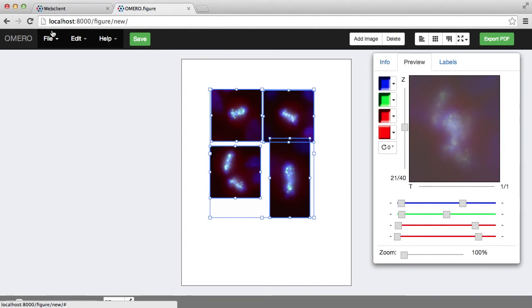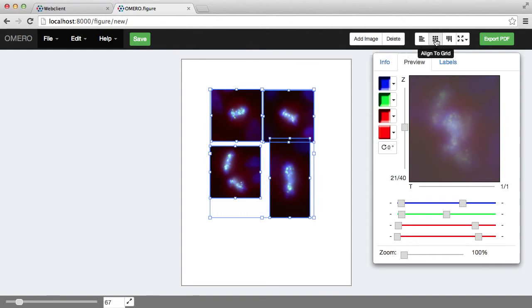On the top there are some menu options to the left, and on the right there are some shortcuts for organizing images.